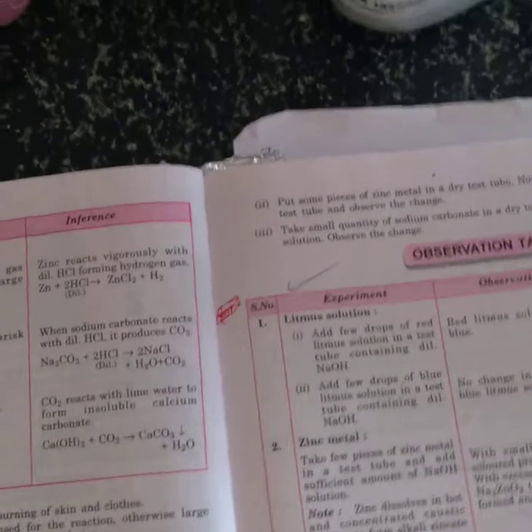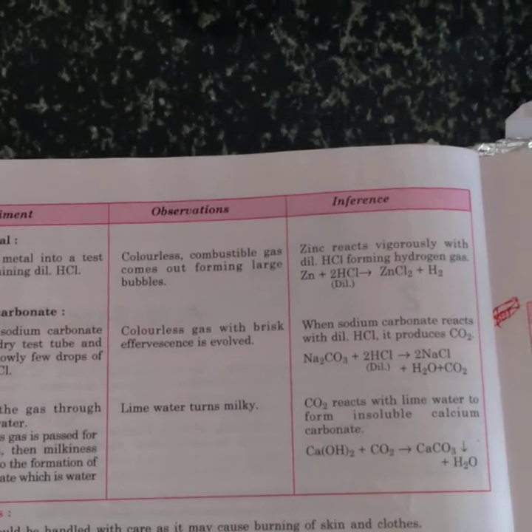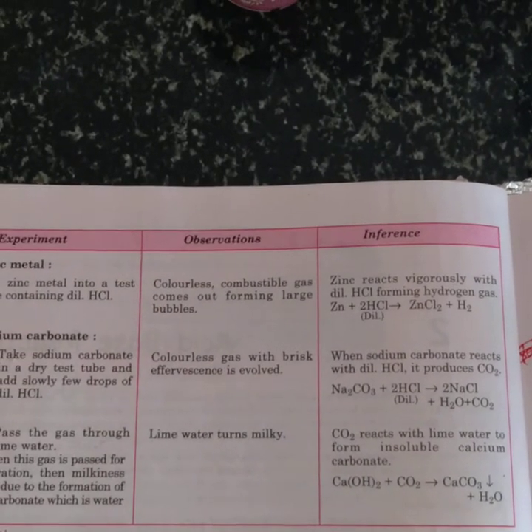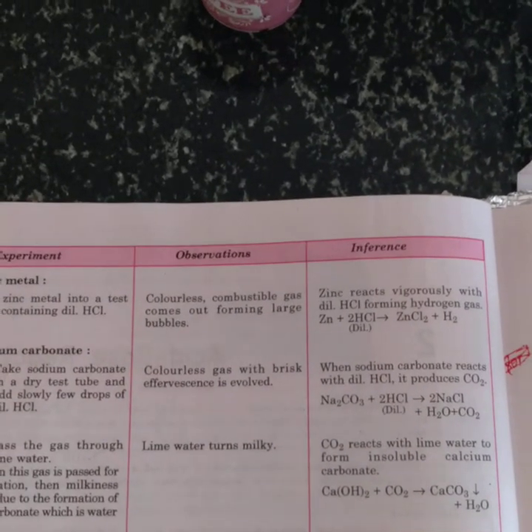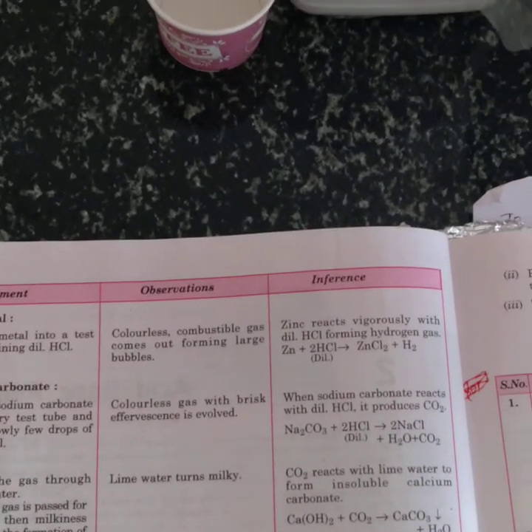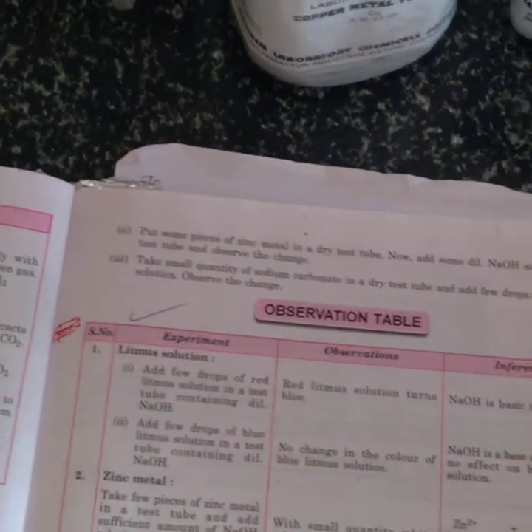Next comes a very important test, the zinc metal test. The reaction of hydrochloric acid with zinc metal. What happens if dilute HCl is added to zinc metal? So we can take a test tube. This is a clean, dry test tube.